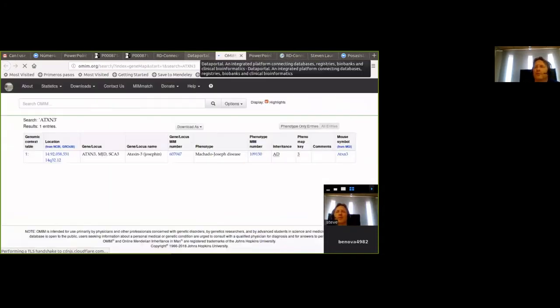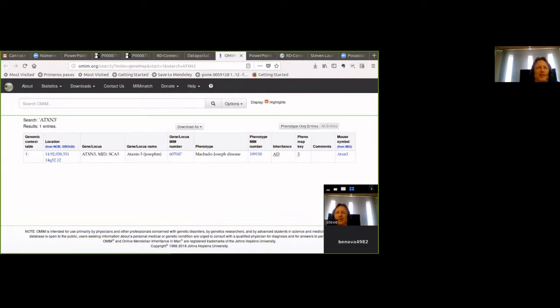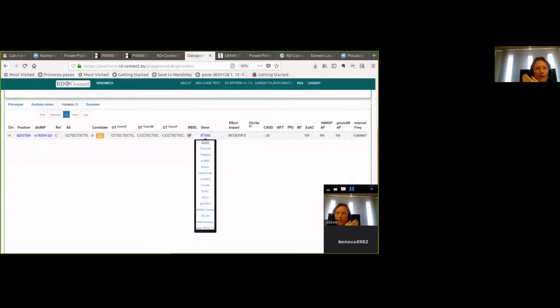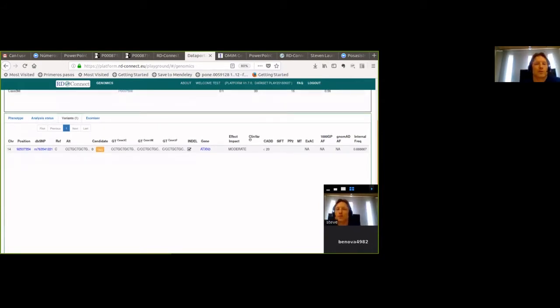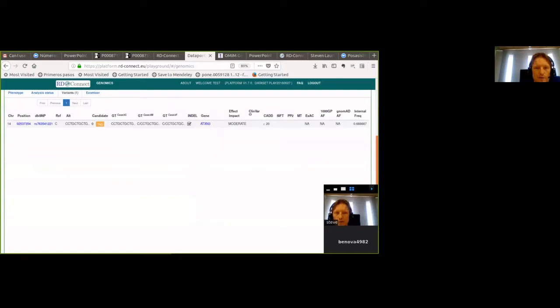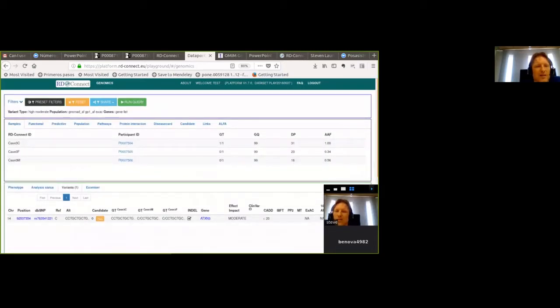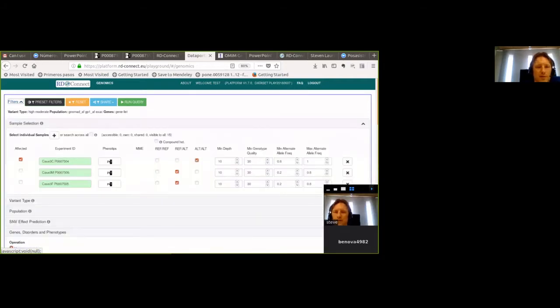Checking in OMIM, Ataxin-3 is involved in Machado-Joseph disease — but importantly, the inheritance pattern listed is autosomal dominant. That means OMIM says variants in this gene cause disease in a dominant manner. We're looking for an autosomal recessive variant, so this doesn't make sense as a causative variant — if it were dominant and this were a double hit, one of the parents would also need to be affected. Of course, some of you might be thinking it could be a compound heterozygote.